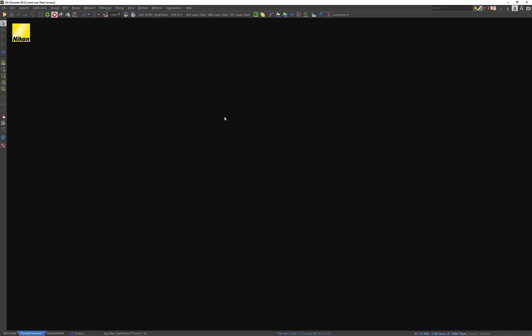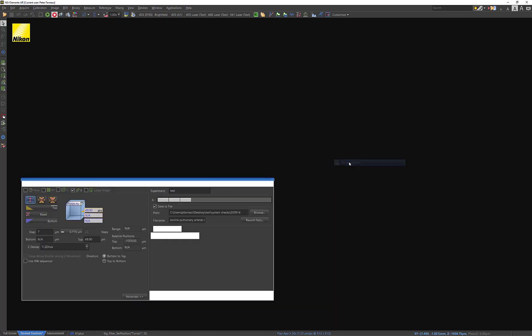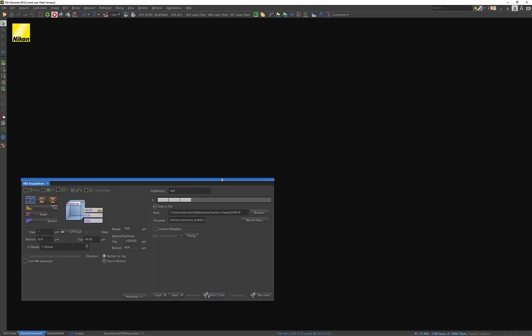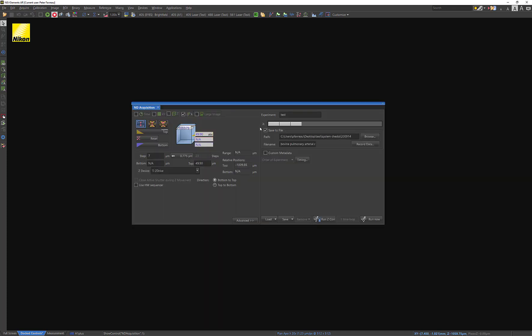To get started, I'm going to go ahead and right-click anywhere in here and open up ND Acquisition, because ND Acquisition is the window that's going to allow me to do a Z-Stack. So to find that, you go to Acquisition Controls and then ND Acquisition right here. So open this up and this window comes up.